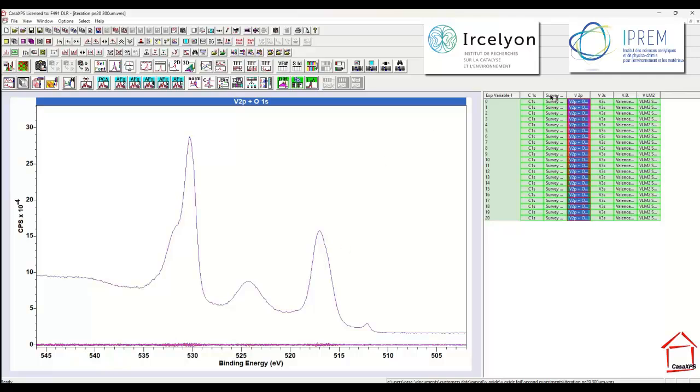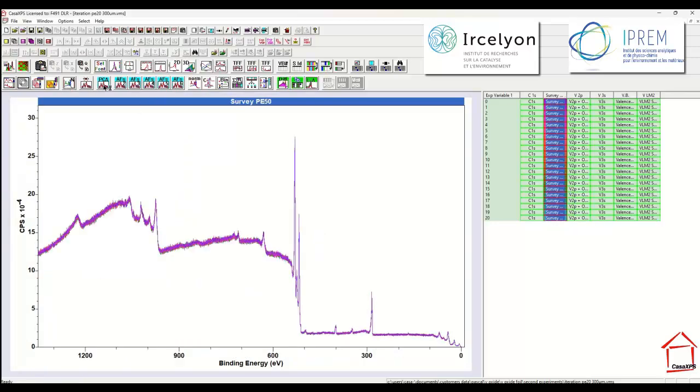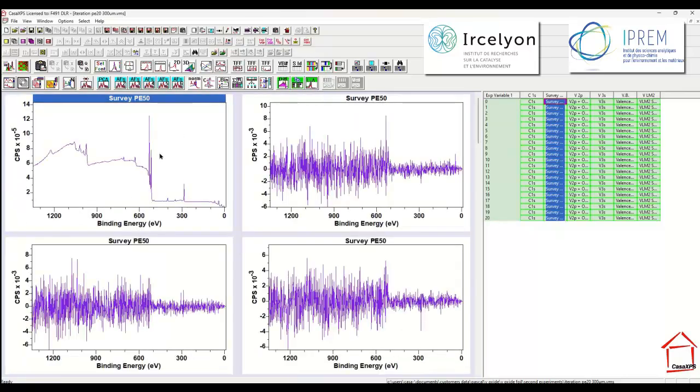Let me just verify that the same is true for the survey data. So I've now calculated the abstract factors from the survey data. Let me just display the data so that I can see I've got one abstract factor that looks like the spectrum, and all these other abstract factors look like noise.